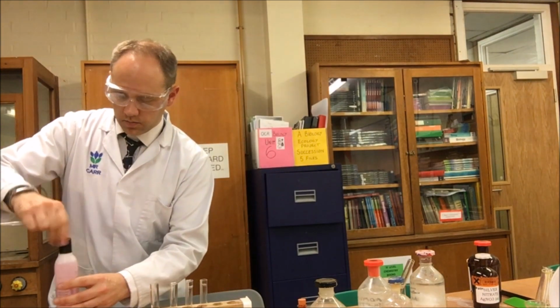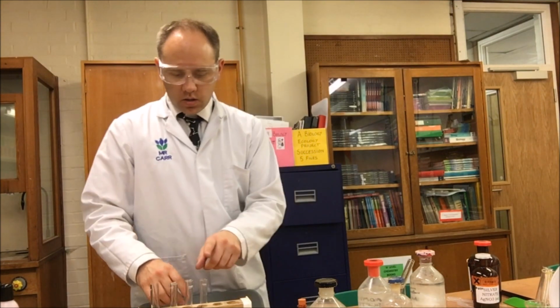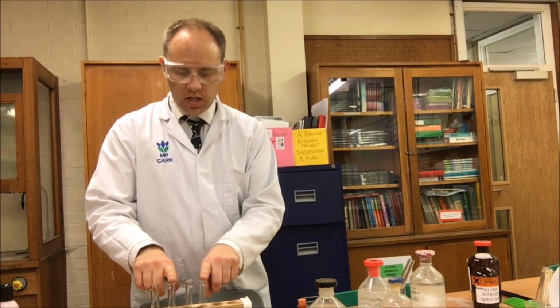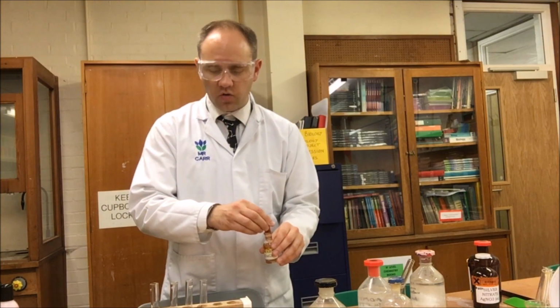Now then, this sugar and this ketone I'm going to test with Brady's reagent, the 2,4-dinitrophenyl hydrazine.